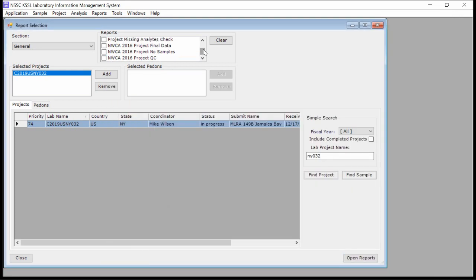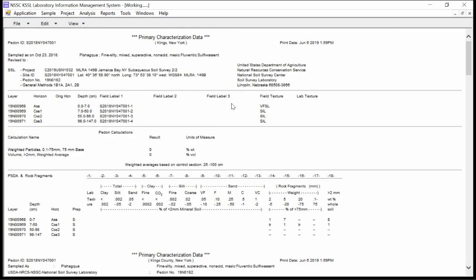Yes. So, yeah. And those other reports, like the ANDIC report, are kind of underutilized, but they're very helpful in that they say, if you look for the 1/2 iron plus aluminum extractable that you need for ANDIC, it's already calculated in there. So get your folks to look at those. They're useful, and some people don't even know they're there.